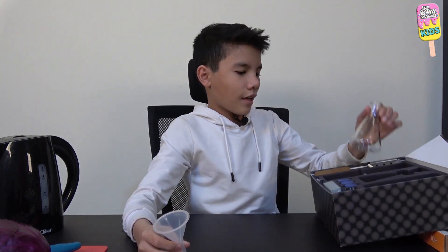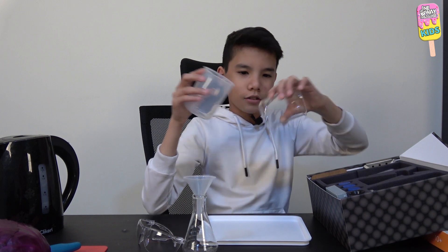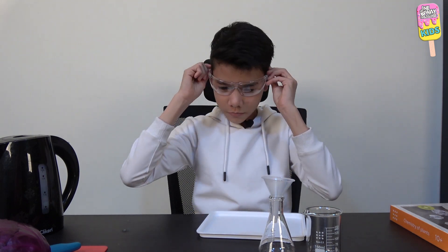I'll take out the funnel, the flask, plastic tray, smartphone stand — even though we don't need that — and a glass beaker. So this is what we have taken from the starter kit: the glass beaker, flask, funnel, plastic tray, plastic goggles which I'm going to put on now, and the phone stand.